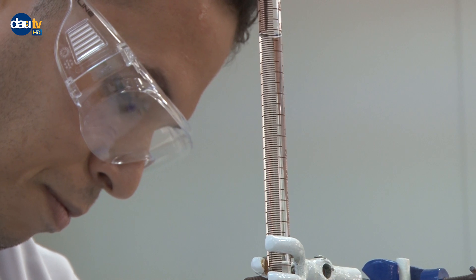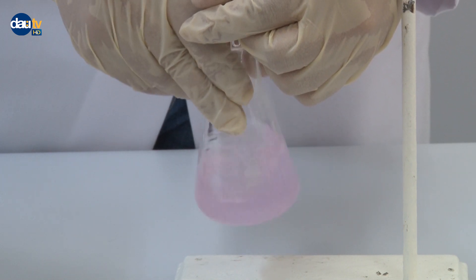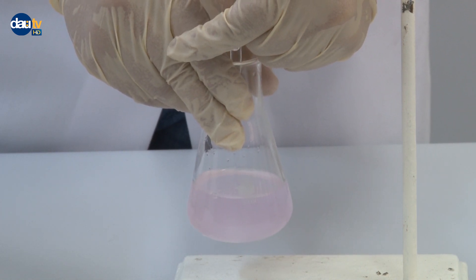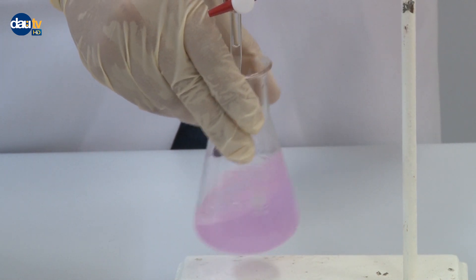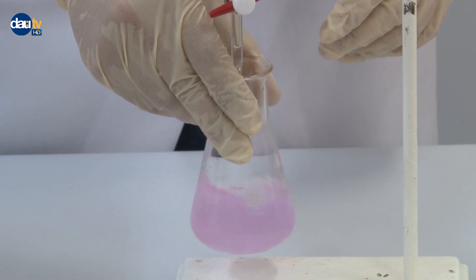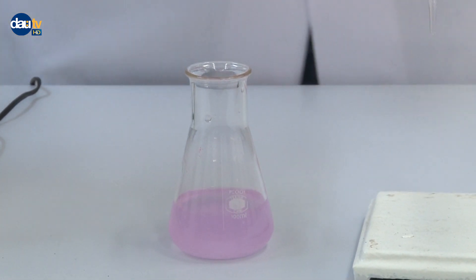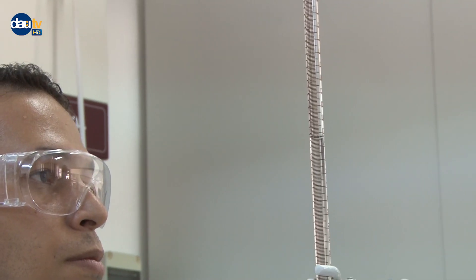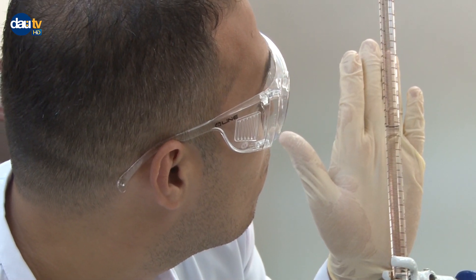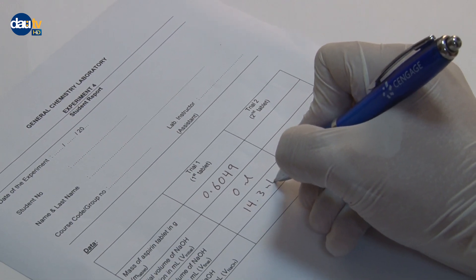A permanent color change to pink is observed, which is the end point. Record the volume of sodium hydroxide solution in the burette.